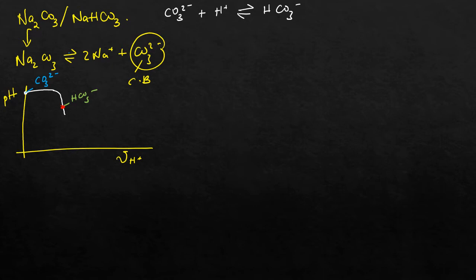As we proceed by adding more hydrogen ions from the acid, we're going to convert this product to carbonic acid.